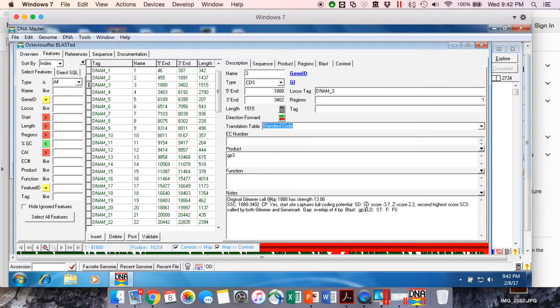We'll say aligns 1-to-1 with portal protein from Leo and Halo. So this is saying that if we look at the BLAST results, we're going to see that those two align.